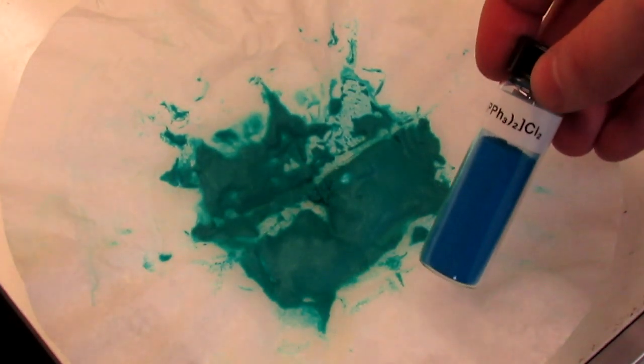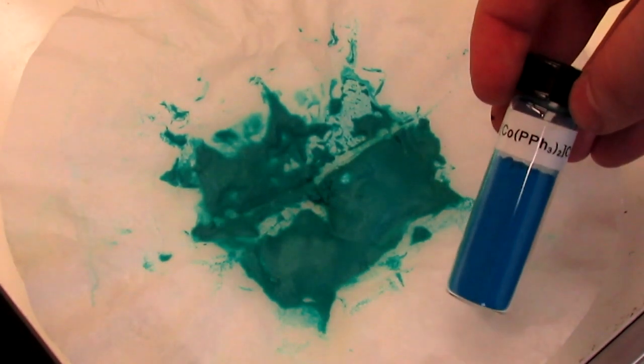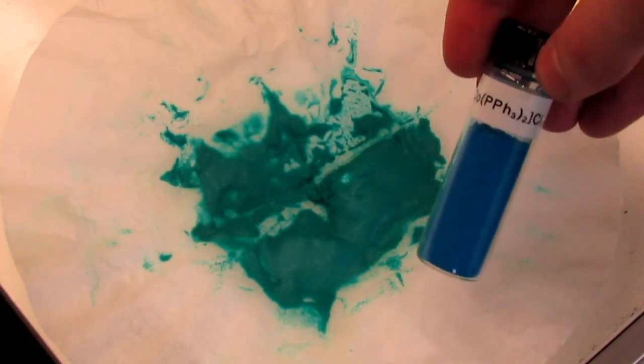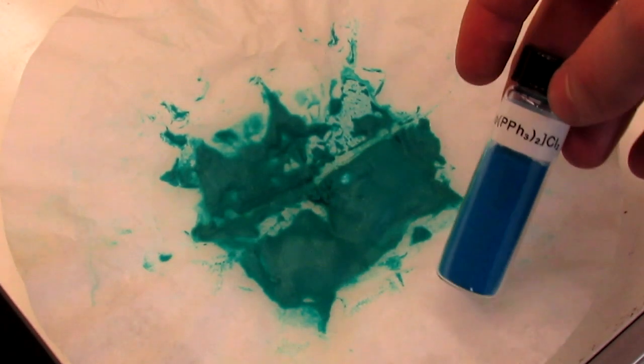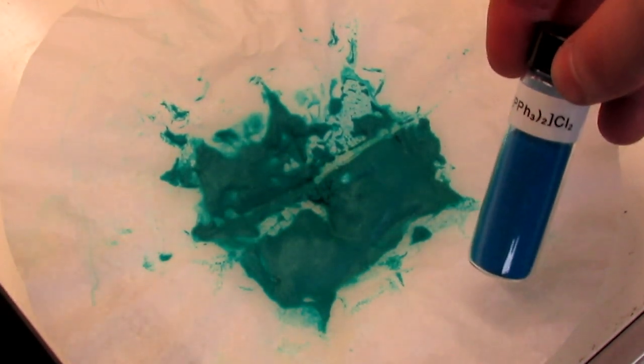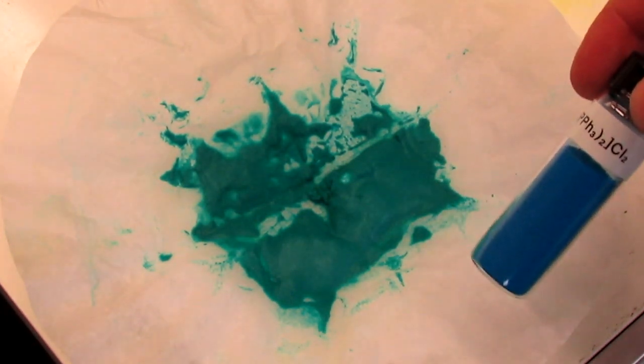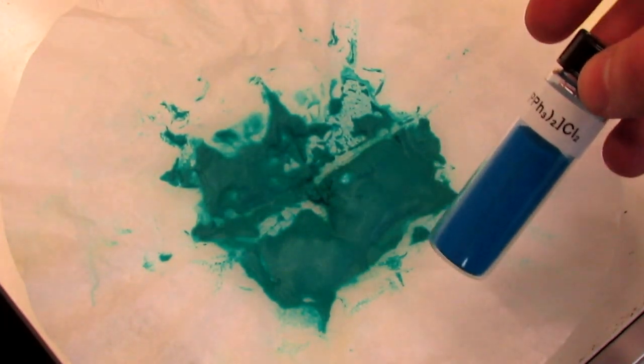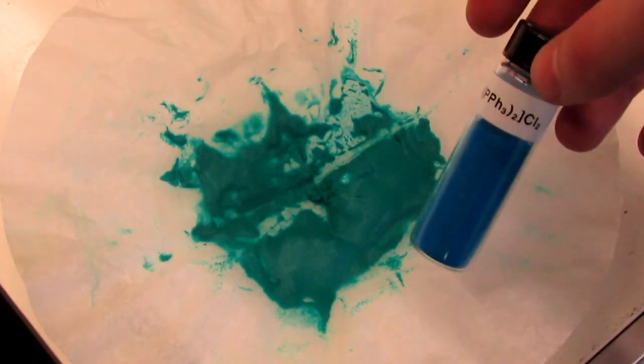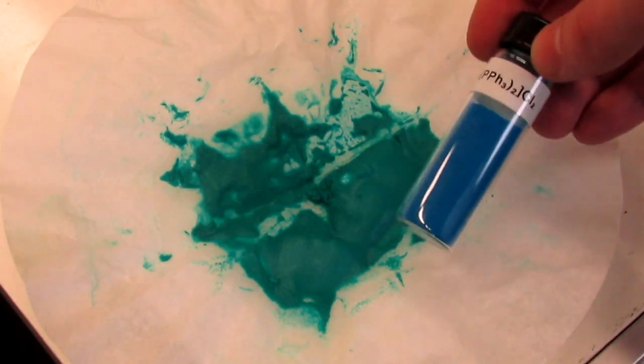Here's a side by side of the two compounds. In my hand I have the chloride complex, and on the paper is the bromide complex. It still looks a bit blue on the camera or in the video, but it is an emerald green color in real life. The camera just doesn't pick it up very well, but you can see the difference in colors here.